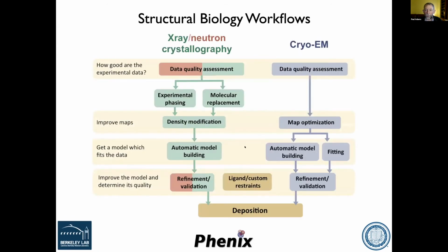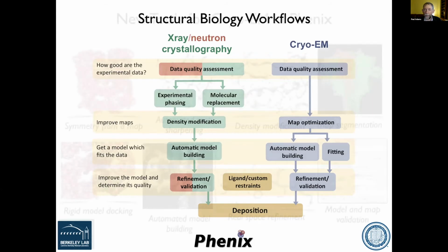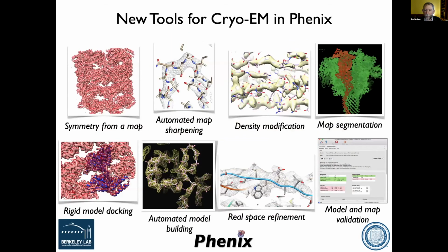I'll skip over this, but just to say that crystallography and cryo-EM actually have a lot of steps in common when you get past getting the initial sort of data or the reconstruction. So that's one of the reasons it's been possible to generate a whole set of tools, new tools for cryo-EM. Not the topic of this workshop, but it will come up in a future workshop. We'll do another cryo-EM workshop, I'm sure. So if you're interested in that, watch out for the announcement about that workshop.